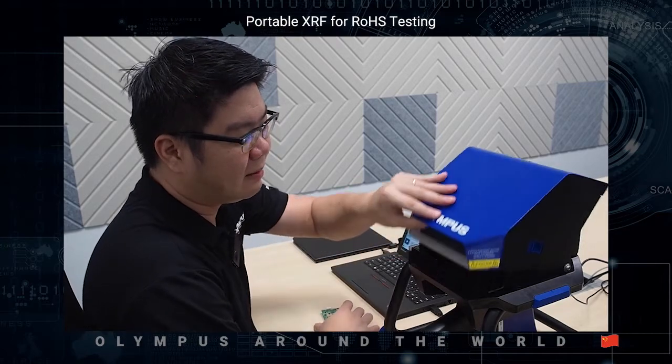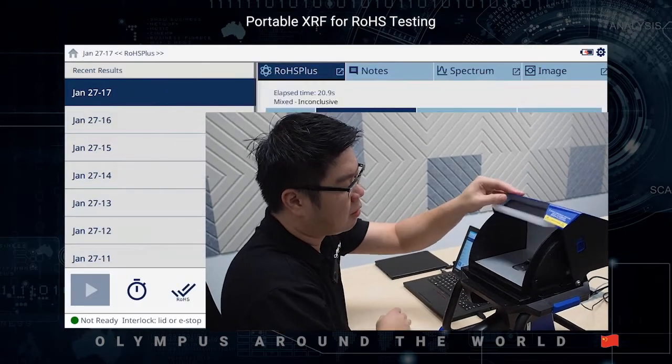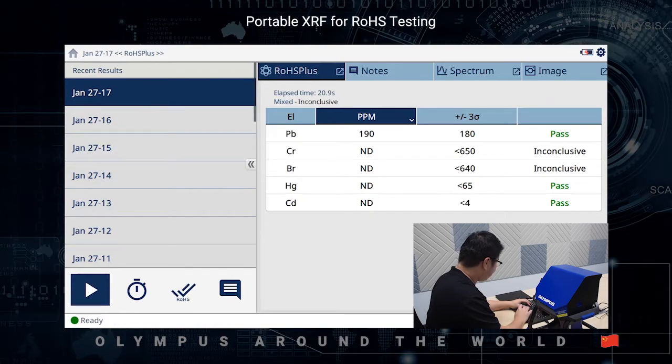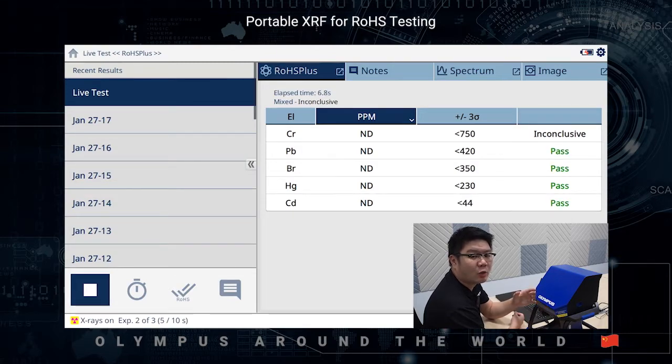This is the workstation. To start the test, open the lid, place the sample in, close the lid, go to the PC software, and click on the play button to start. The workstation comes with a safety interlock feature, whereby if you were to open the lid halfway through the analysis, X-ray will be cut off immediately.